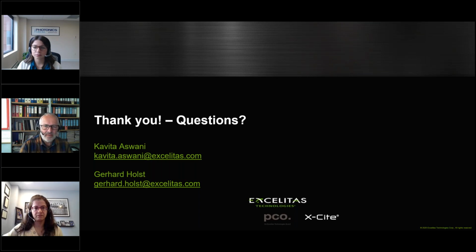And there are only few objectives that are corrected for both ranges, from visible to SWIR. And only these don't have to be refocused. Otherwise, you have to live with the fact that when you change the illumination from, let's say, SWIR to NIR to visible, then you will have to refocus to get a proper focal plane on your camera.